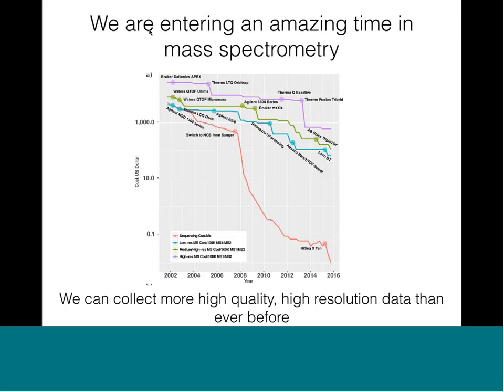And so if you look at the top 3 lines of this particular image that I show you here, that is really the decreasing costs associated with mass spectrometry analysis. This is the cost per data volume. This is high resolution, medium resolution, and low resolution, but for each one of these different infrastructures, the cost has come down about 2 orders of magnitude in the last 15 years.